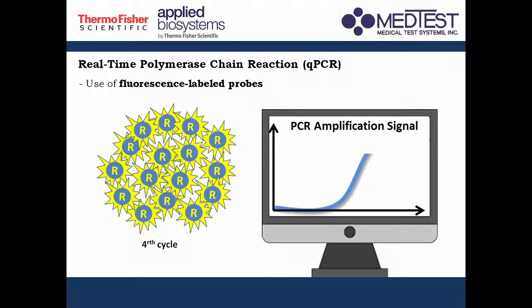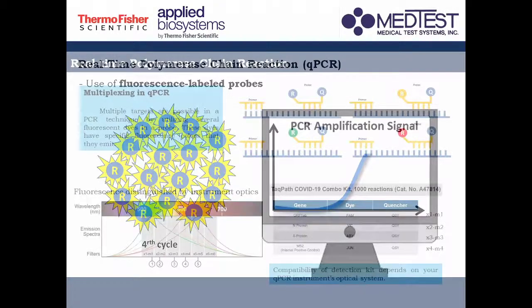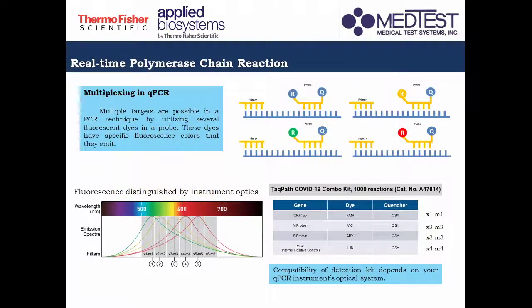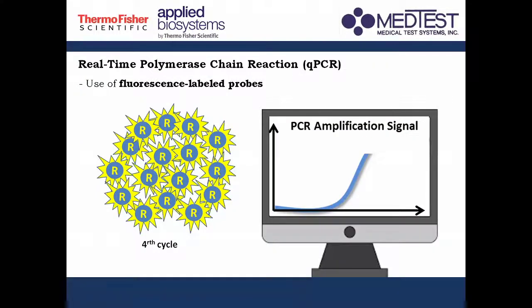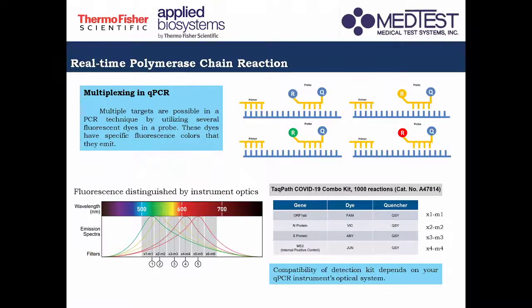So, you know, until such time that the PCR would reach the number of cycles that you have instructed it to do. Okay.